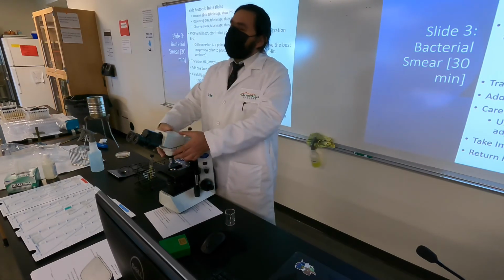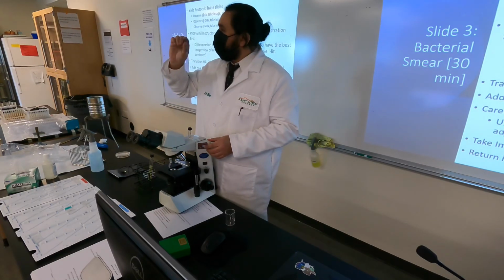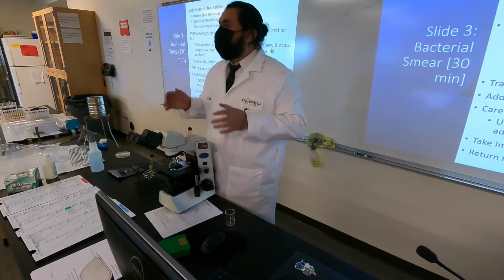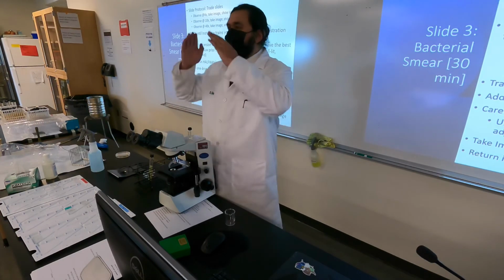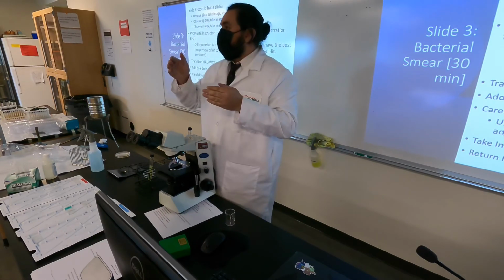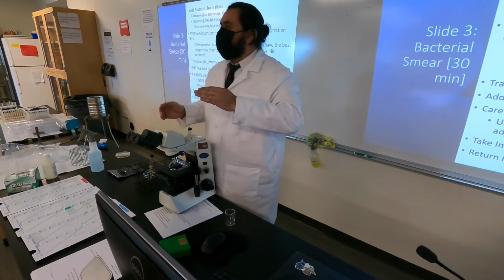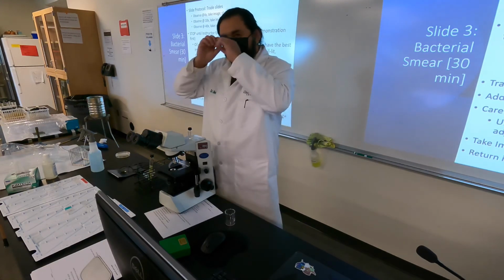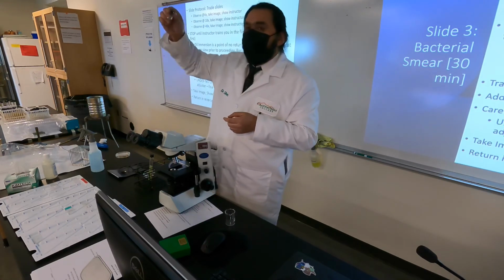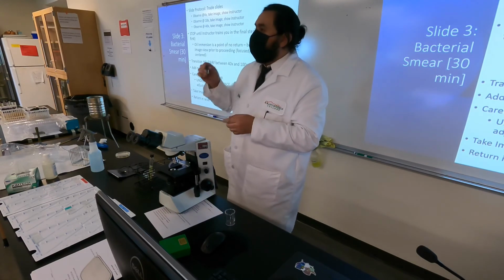We're gonna move between the blue one and the next objective, the one that has a white and black rim, and you're gonna do this. You're gonna turn it halfway such that both of your objectives are in this inverted V format, right? So the blue objective is hanging out to your left, the white and black objective is hanging out to your right. And so that'll create this little pocket, this little triangle, this inverted V, in which you can apply 1 drop of oil. And I say this repeatedly, 1 drop.